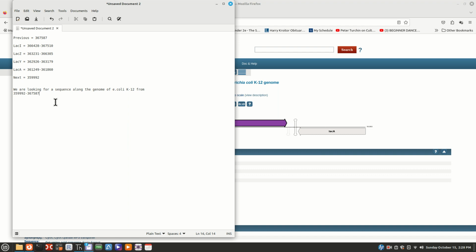Let's go ahead and put this out there as the lac operon, and they even included the I sequence. But actually, you really do want some more sequence out there. It would be nice to have it all the way to the previous gene and then all the way to the next gene. So this is probably the preferred way to do it than the way I did. They didn't do it. They didn't have maybe everything like the -35 sequence. I have a feeling from our previous work, we're missing a few letters that could have helped identify the -35.